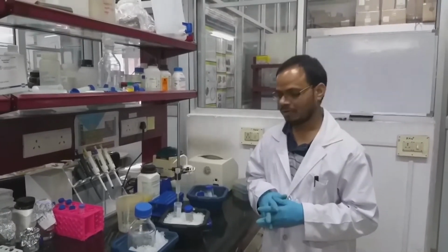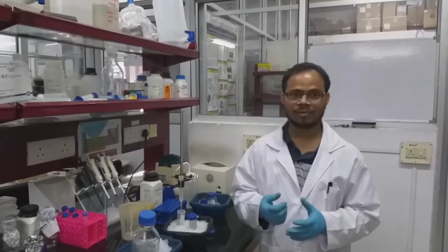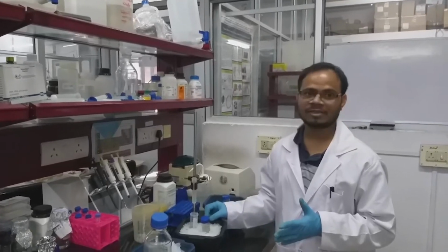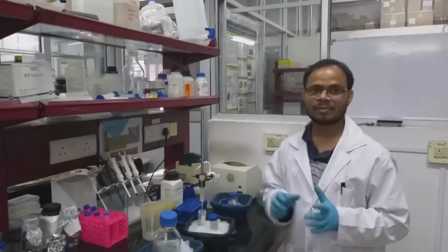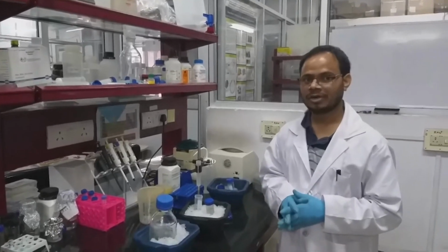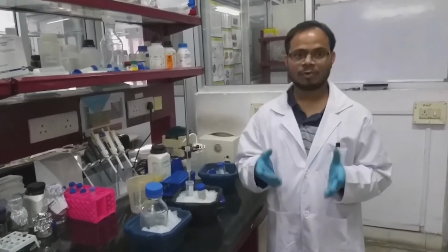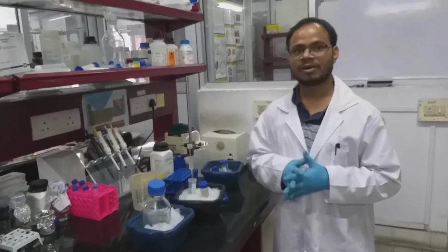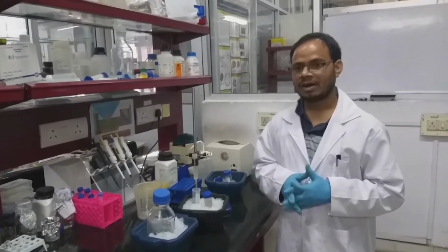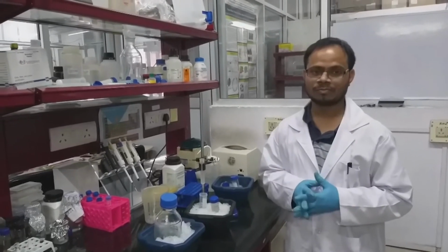While doing purification, we have to remember that every time you are introducing a new buffer, you have to collect the fraction, and this can be used for running SDS-PAGE and testing the purity of the samples. Also the flow through part and washing part which we have collected, we have to keep safely. Only after verification of the gel should we throw them away.